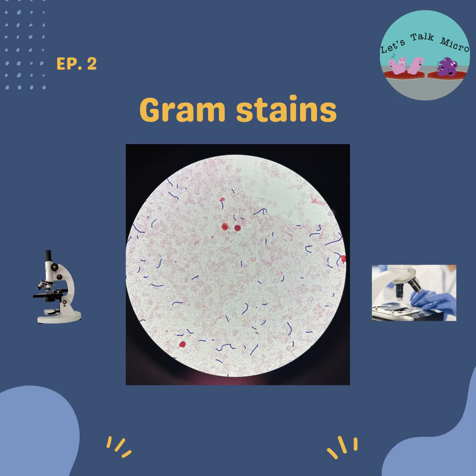Alpha is partial lysis, and by partial lysis, of course, they don't completely lyse. The agar turns a green color. Beta is complete hemolysis, so you should see through the agar. And then gamma is the term that we use for no hemolysis, so there is no change in the agar.